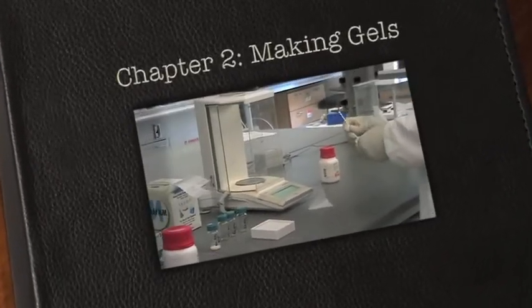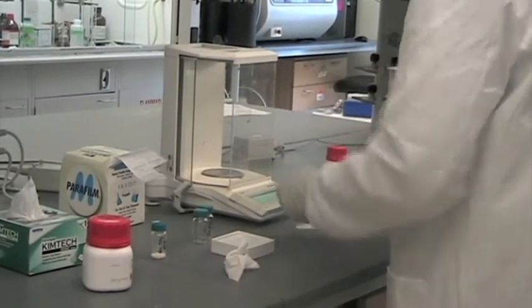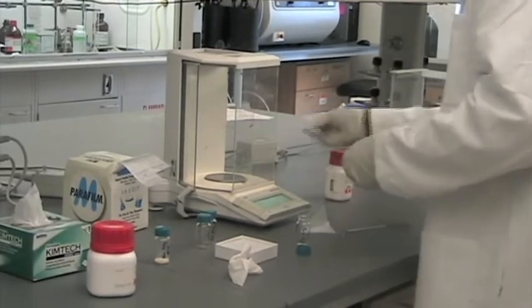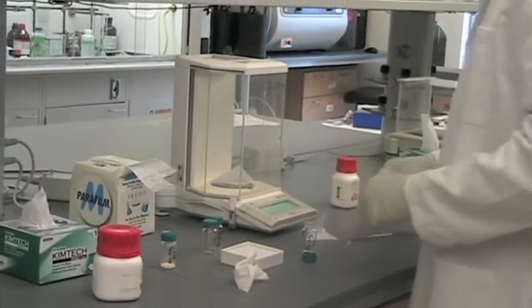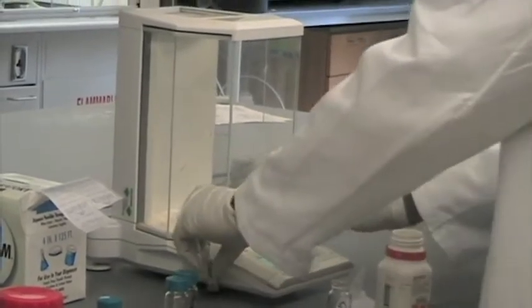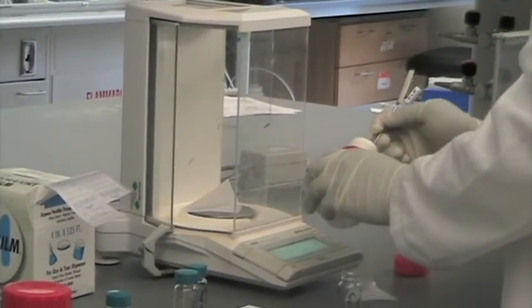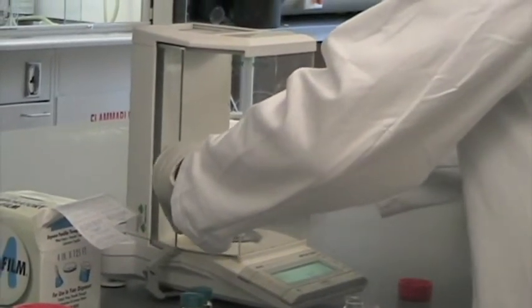Okay, right now I'm at my bench trying to make some alginate hydrogels. So I'm folding a piece of paper to put on the scale. I'll zero the scale and then weigh out my alginate. I'm making alginate gels of different concentrations: 10%, 5%, 3%, and 1%. And then we look at the viscosities of these gels. Definitely they will have different consistencies. And then we'll use the rheometer to measure their viscosities.